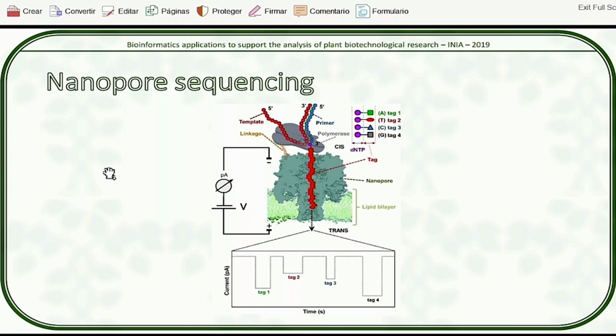And you will see that when we do the k-mer analysis of your raw reads. Whenever you have high heterozygosity, you will always have two peaks. A high peak that corresponds to the homozygous region of the genome, and a lower peak which corresponds to the heterozygous part of the region.